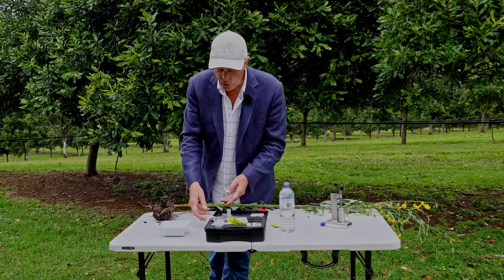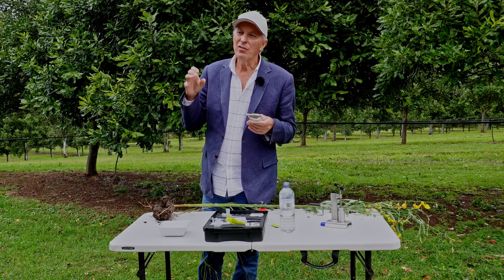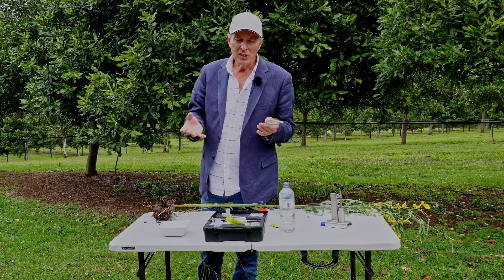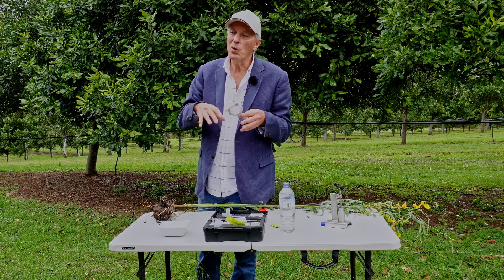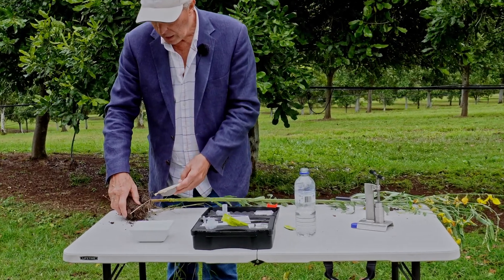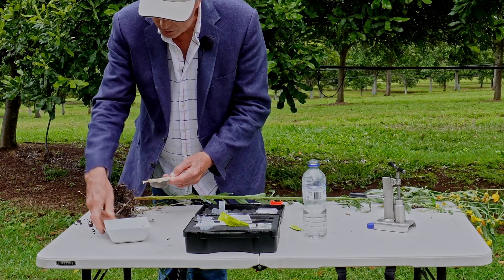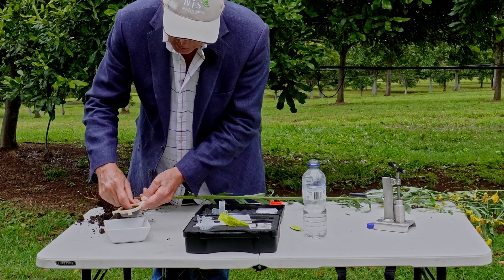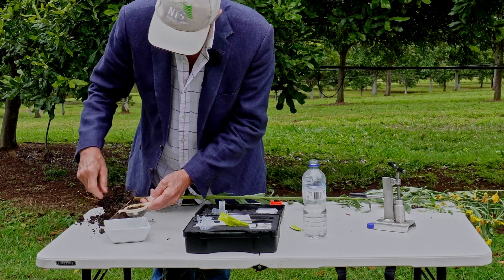Now we get a soil sample. We're going to screen some soil using the little screen. This is really important: we take the soil right beside the roots, because we're looking for the optimum count — things at their best. The plant is giving away 30% of its total glucose production, feeding it to the soil life, so the soil life accumulates in huge numbers right next to those roots. That's what we're looking for — that best-case scenario. We take some of this beautiful crumbly soil and run it through the screen.